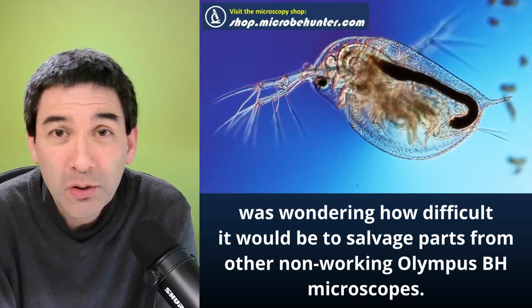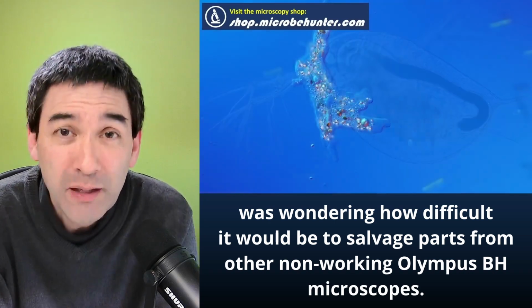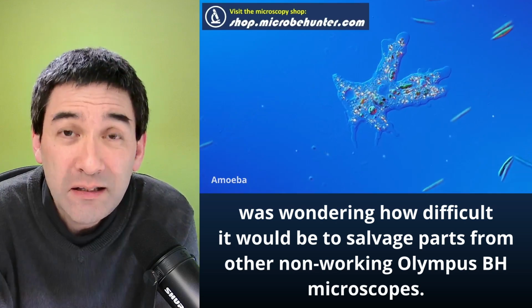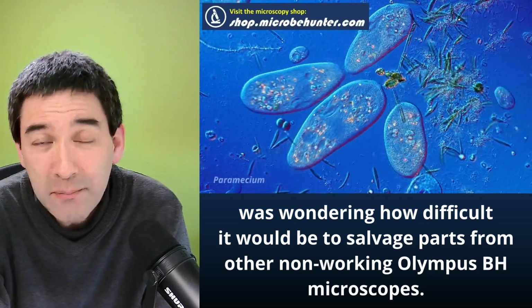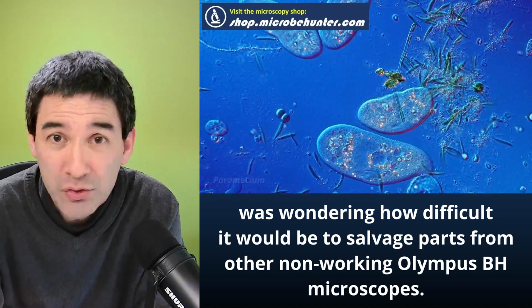But that's not a problem, because there are service manuals available which allow you to disassemble a microscope, get it cleaned and fixed again. But you don't even have to go into that detail. If you're able to get eyepieces and objectives and whatnot, you should be able to put together your own microscope.